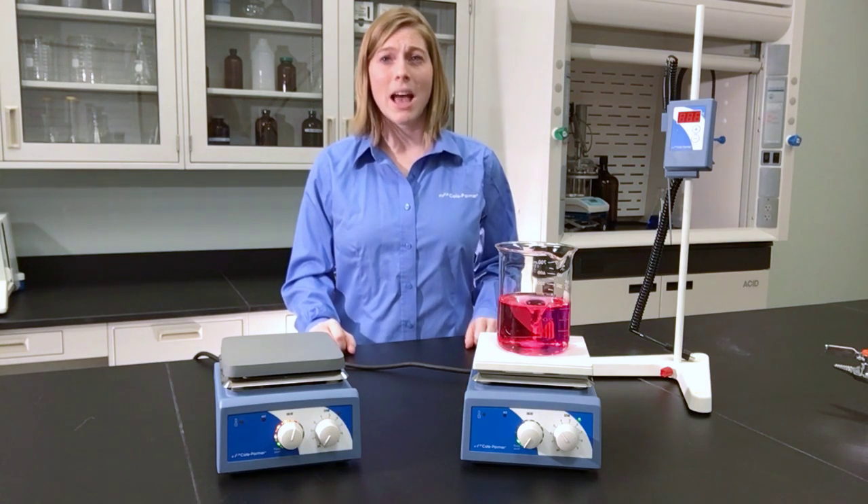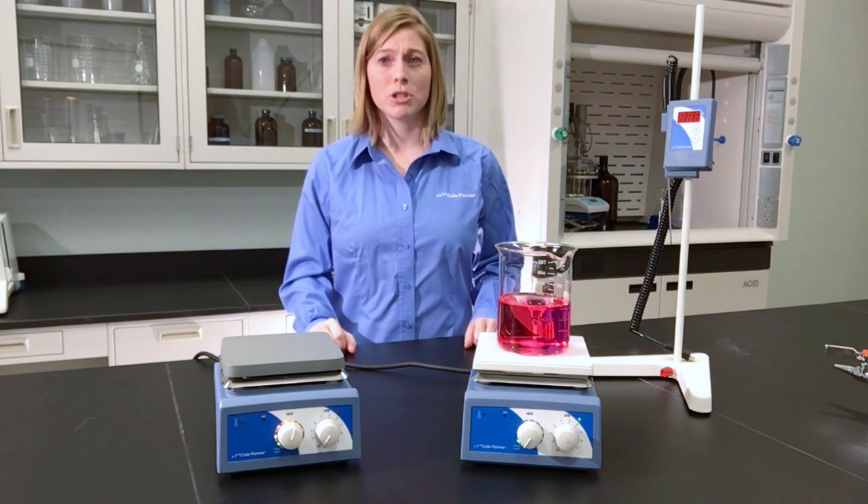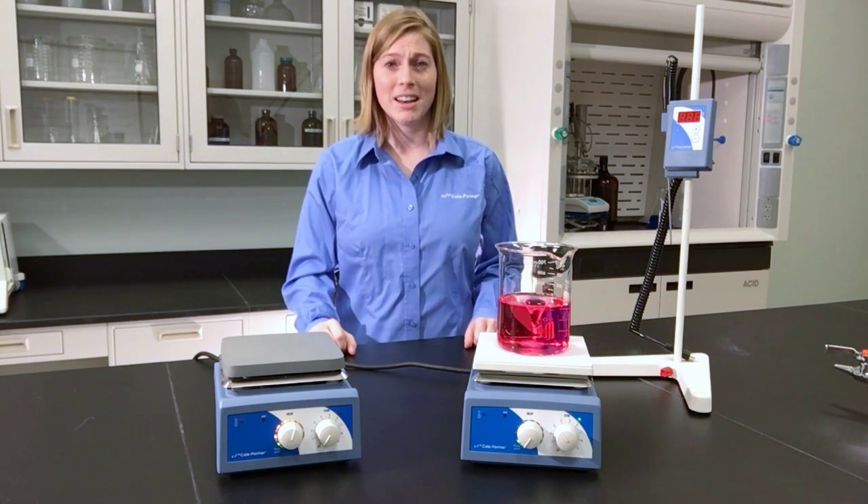And for even more control, add the optional digital thermometer. It accurately controls temperature to prevent your sample from overheating. Get stirring today!